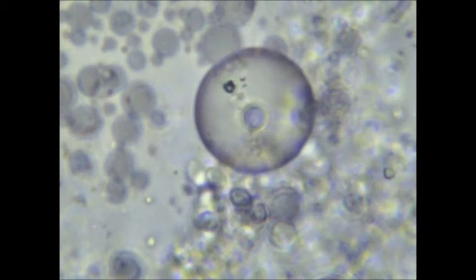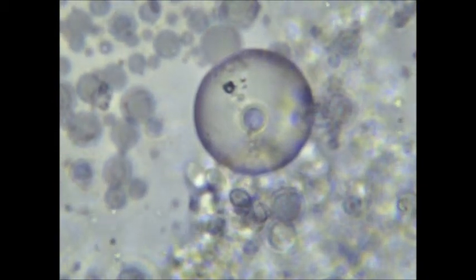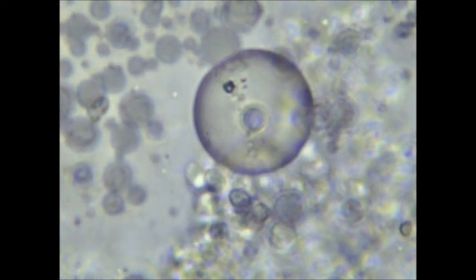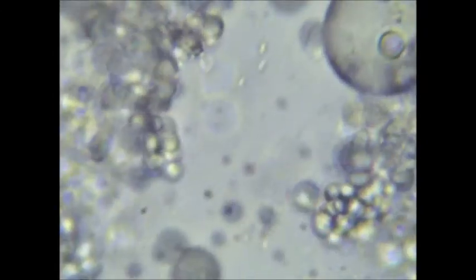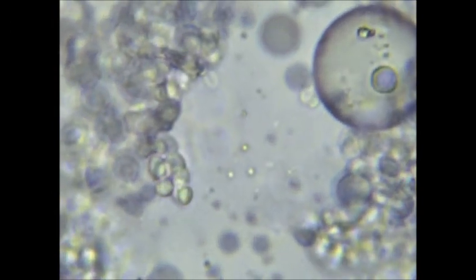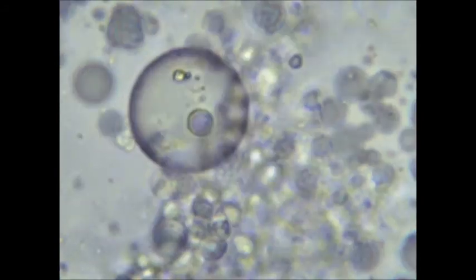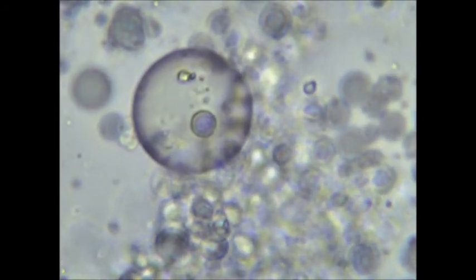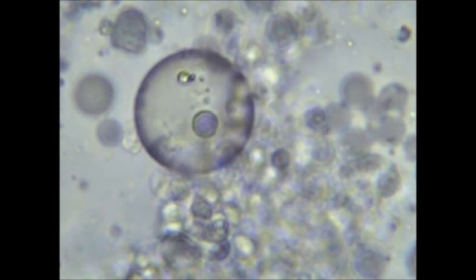I'm not going to say for sure that what I'm looking at is in fact a protocell — that would be wishful thinking. But at first glance, it certainly looks like it could be. I'm an amateur scientist and I have only been interested in this subject for a few months now, so I'm very skeptical about my ability to create a protocell with my limited knowledge and my gross lack of technology, since scientists have been working on this for decades.